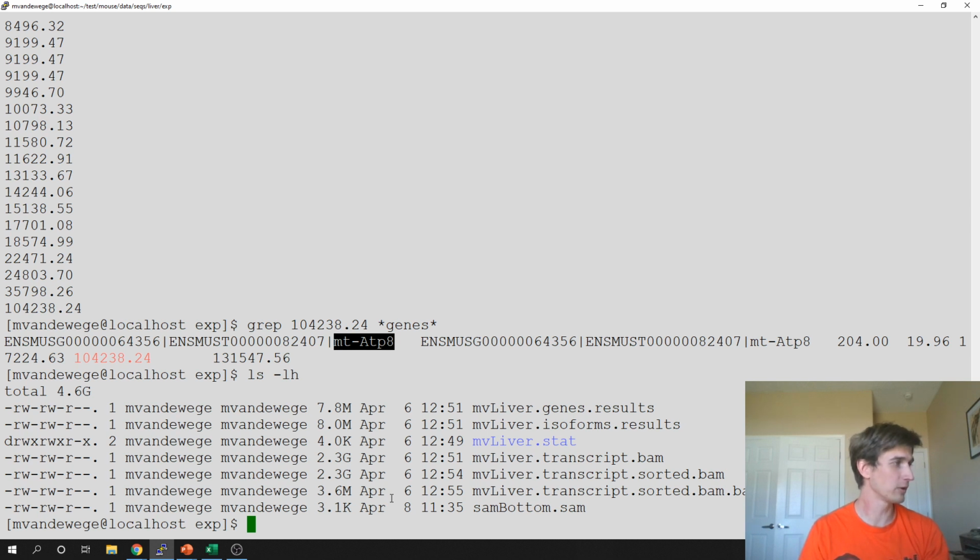All right, so that's all I really wanted to talk about today, which is just the BAM files, and also the gene results files, the output of RSEM.